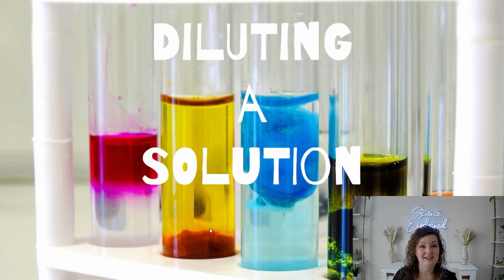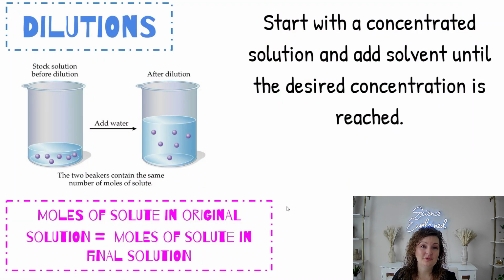Today I'm going to teach you how to dilute a solution. So first up, what exactly does that mean? It means that we're starting with our stock solution, which is going to be highly concentrated, or in other words, high molarity, and we want to dilute it. So we want to add more solvent in order to make it weaker and not so concentrated.